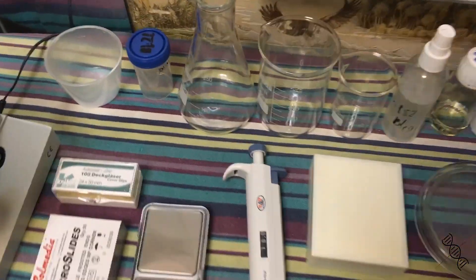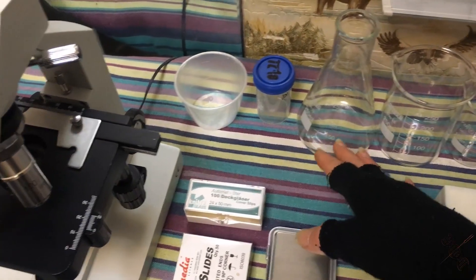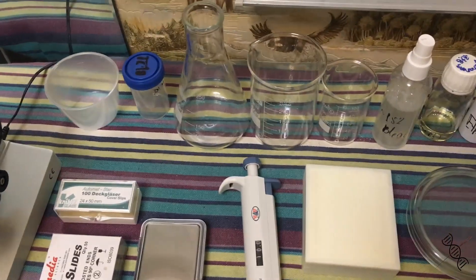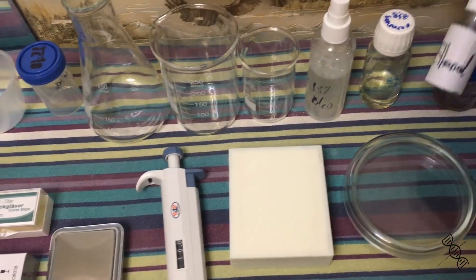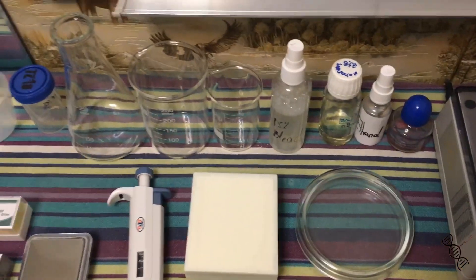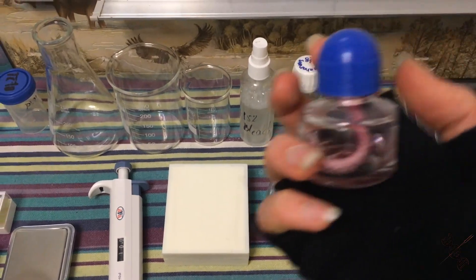Next, we have this glassware — I have three of them: 250 milliliter, 250 milliliter beaker, and also 100 milliliters. This is for my microscope — immersion oil. Ethyl alcohol, 70% ethyl alcohol — my kind of stocking the fire for sterility work.